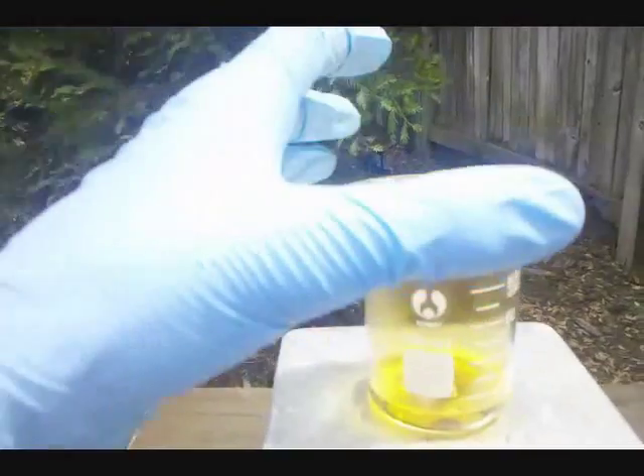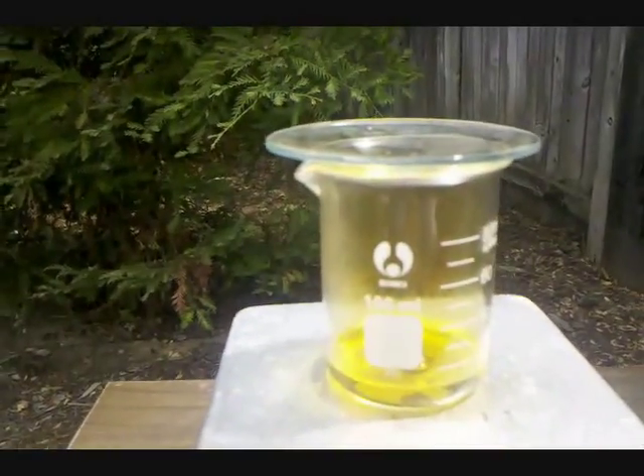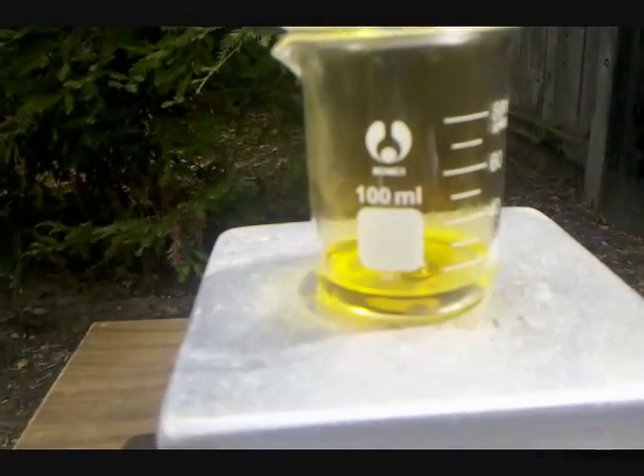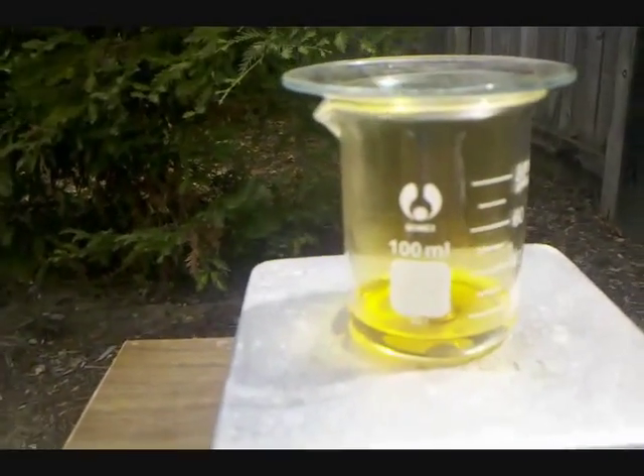I'd also like to point out that I have a watch glass sitting on the beaker, and the reasons for that are: one, it'll help control the Nitrogen Dioxide fumes coming off, and two, if I need to heat it to the point where some of the Nitric Acid starts to boil, then it will reflux some of the Nitric Acid for a better yield.